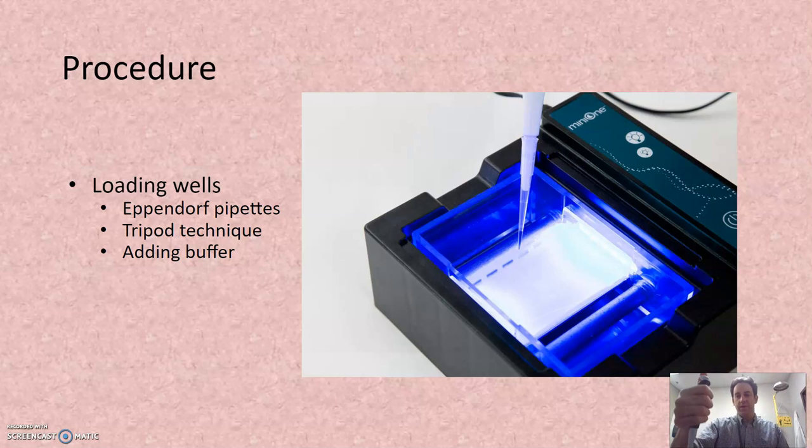Now, the way this works, there's two buttons at the top of this, and they grip right in your hand, so your thumb kind of fits right over those two buttons. The first button, you're going to push it down until it stops just once. So you push it down, it stops. You put it into the liquid you need, and then you raise your thumb up, and that will draw out the precise volume of liquid that you tell it.